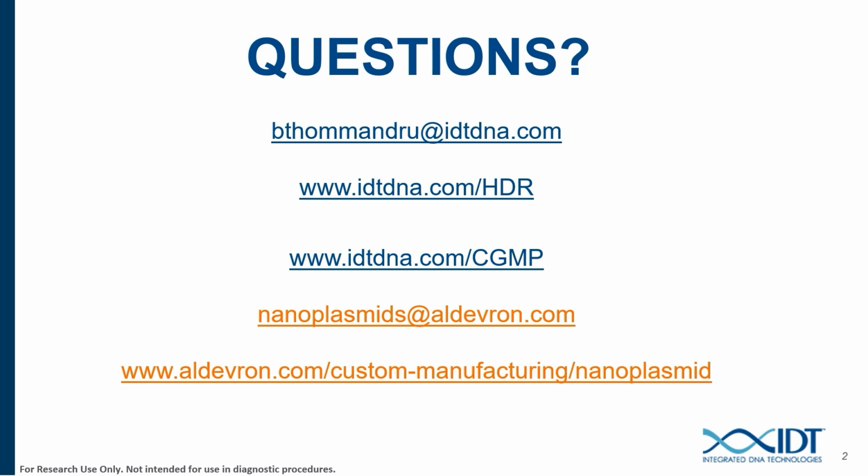There's an important distinction to make here. It doesn't matter as much for NHEJ if you just need to make a knockout, because the Cas9 will get in and cleave DNA no matter what the state of the cell. It definitely matters for HDR because that's a more energetically demanding repair process. So the cells need to be metabolically active in order for HDR to occur. That's why we have to time the activation in a particular way to increase the efficiency of HDR.